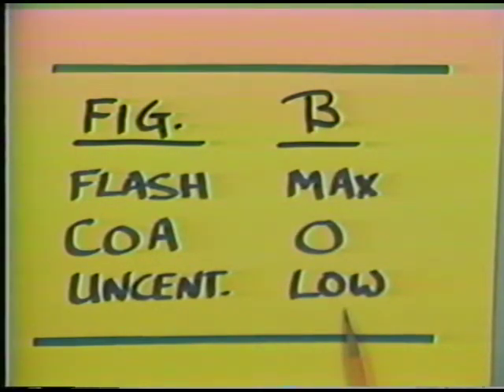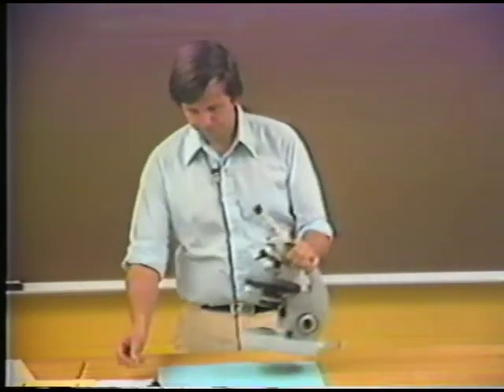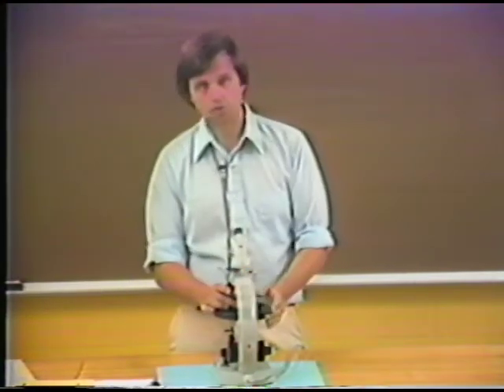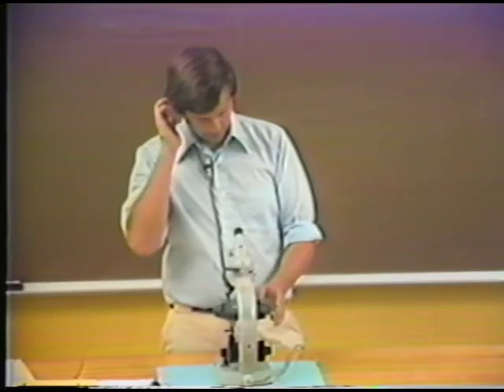I want to demonstrate this with a thin section of the mineral quartz. And this is a quartz sandstone, which I'm going to look at. And this sandstone is full of quartz grains. So we see a diverse field of quartz grains, and I'm going to look at these now in cross-polarized light. And so as I look at these quartz grains in cross-polarized light, you can see a considerable variation in the interference colors which these quartz grains show.